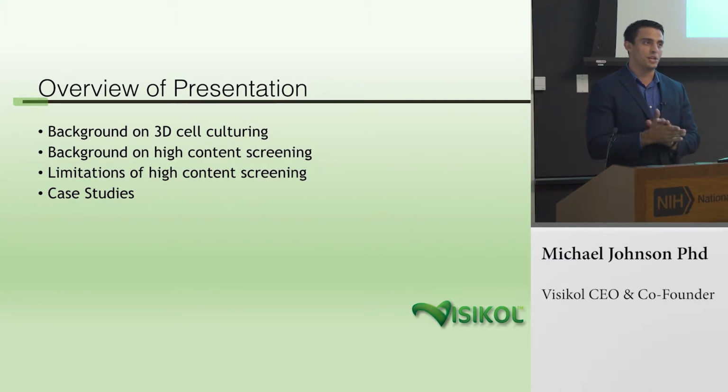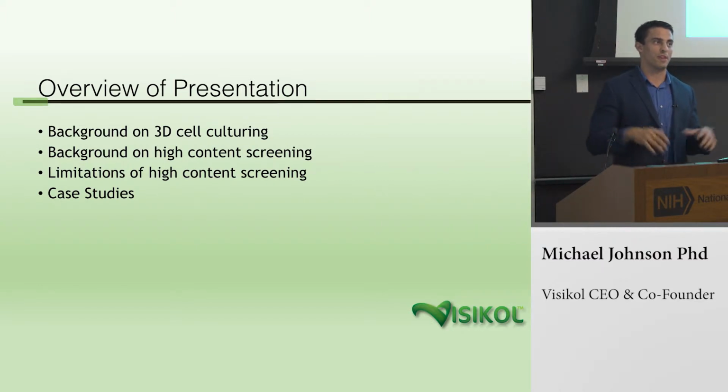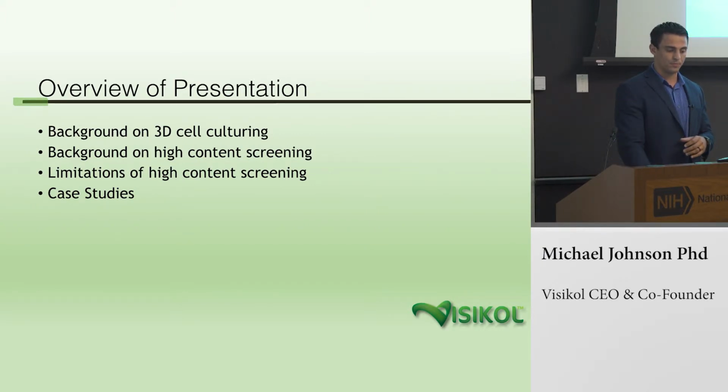Now, for this presentation, I'm going to give a background on 3D cell culture. I know it's been a topic of interest today, but I'm going to take it at a really high level, and then dive into background on high content screening, some limitations of high content screening and the imaging of 3D cell culture models, and lastly, dive into some case studies.